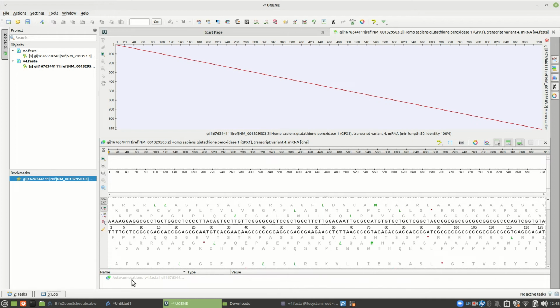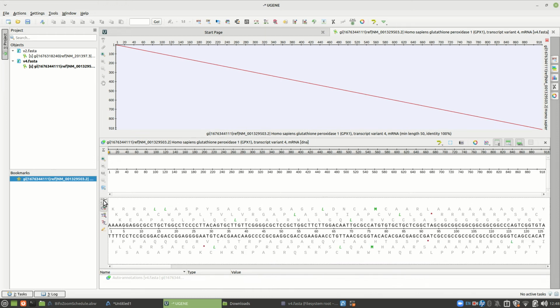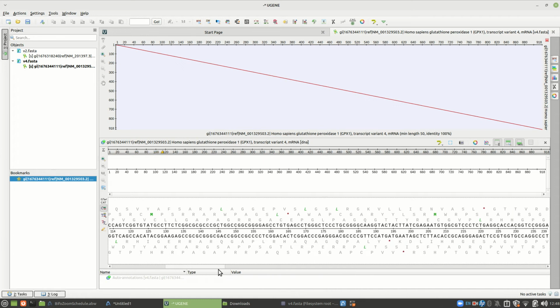Is that it? Nope. I want the one that scrolls along the bottom. Let's see if I can get that. Aha, it's the top button. Sorry. All right, so here's our methionine. We're going to scroll until we see a star. Wow, we see a star at 220.